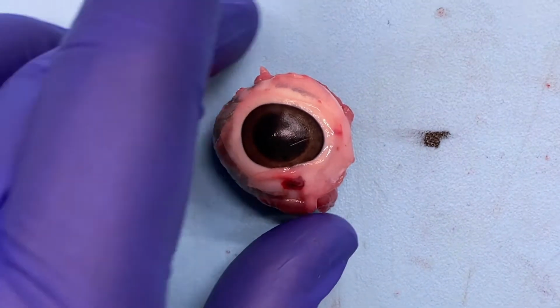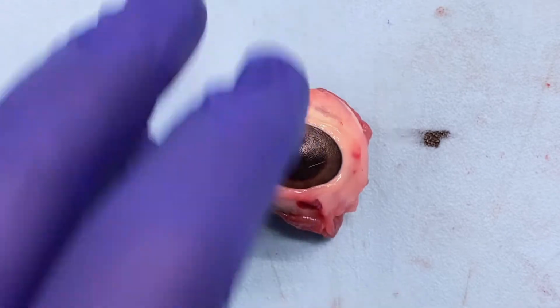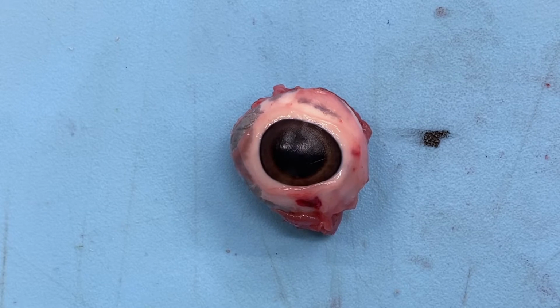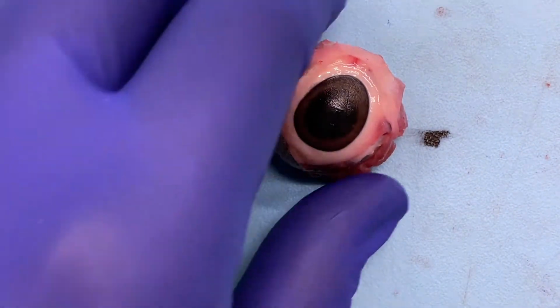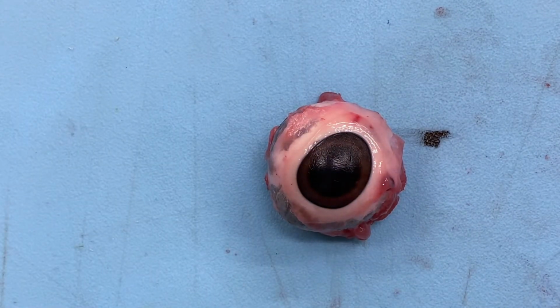When you get these specimens, the first thing you're going to do is look at your patient history. These specimens are typically received for glaucoma in a non-malignant case. But if we're dealing with malignancies, the most common primary intraocular neoplasm is melanoma, which you wouldn't necessarily see on the external surface. But if you do, that's when we start worrying about invasion. And then we'd want to make sure we have some sort of orientation to mark our margins, as well as retinoblastoma. So those are your two common intraocular tumors.